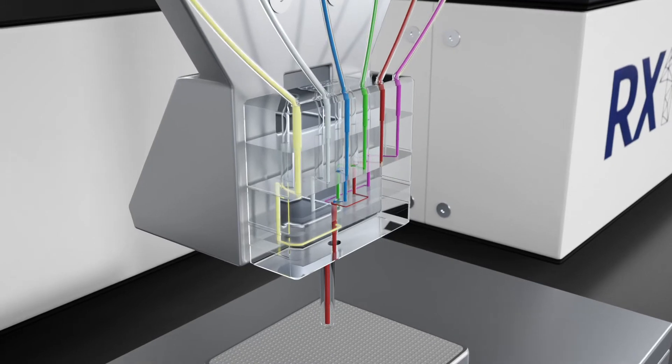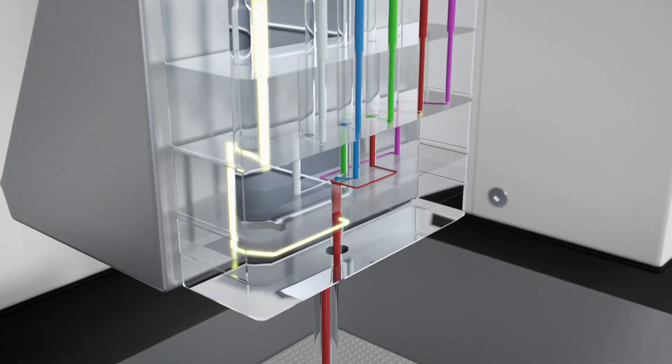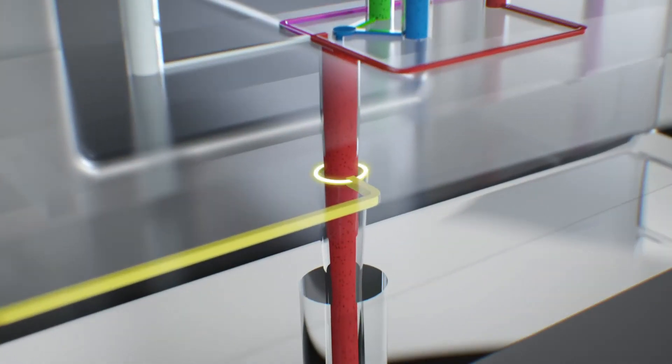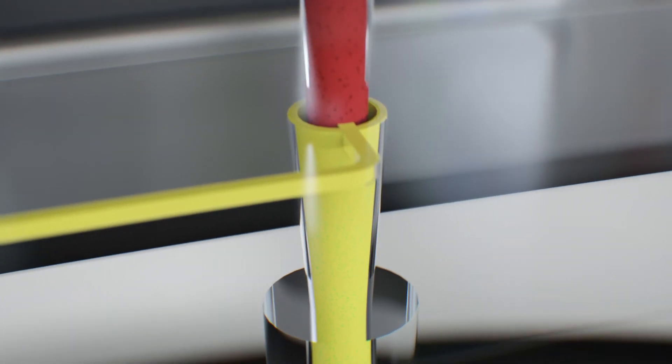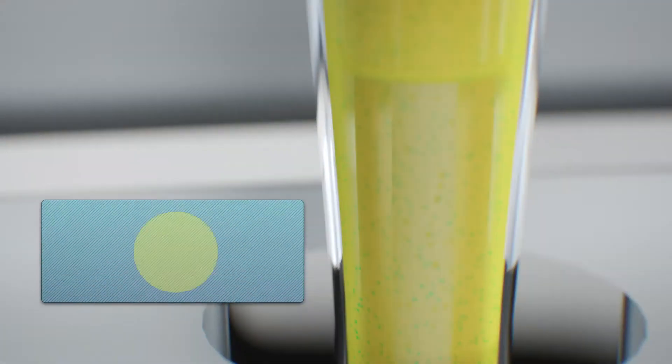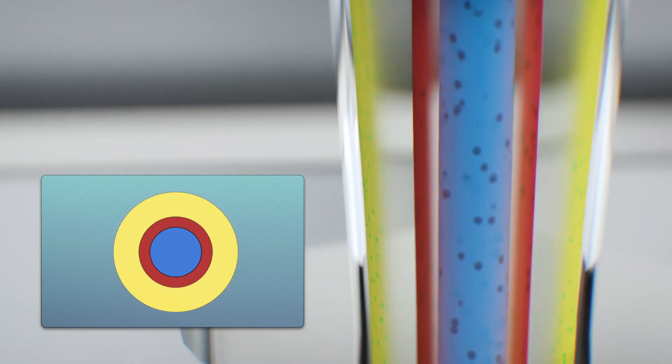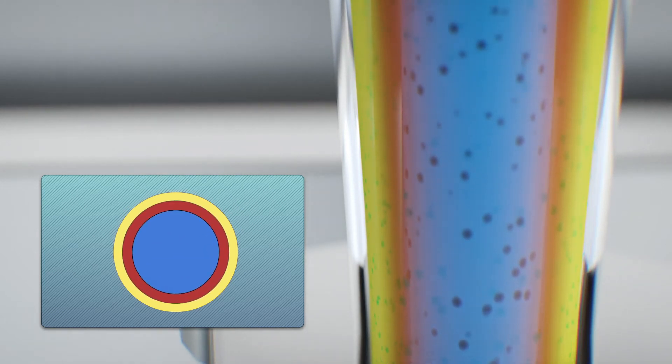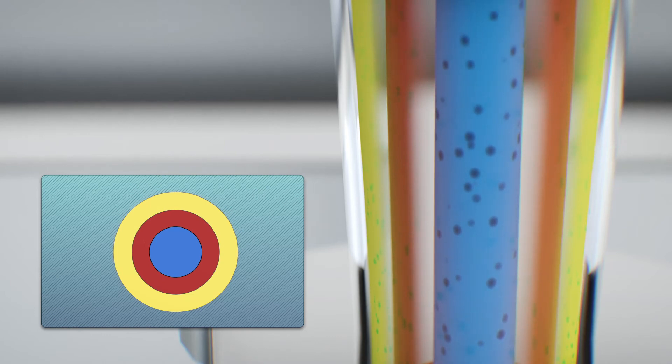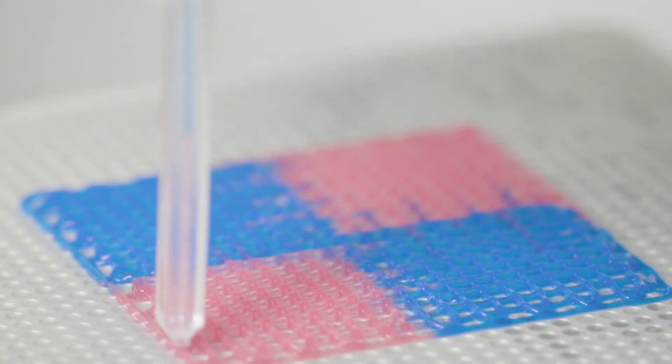A sheath fluid is flowed into the printhead to surround and coaxially flow-focus the bio-ink. A wide range of fiber diameters can be printed with a single printhead by varying the flow rates of the bio-ink and sheath fluid. The sheath fluid also protects cells from shear stresses encountered in other nozzle-based dispensing technologies.